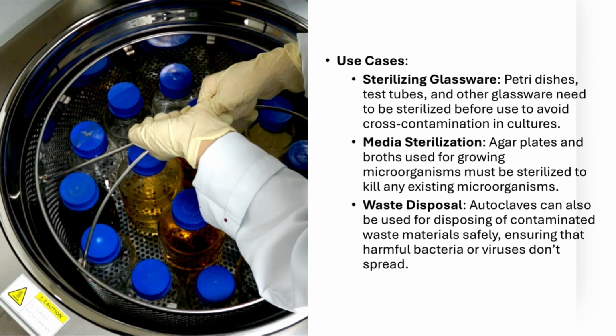Waste disposal. Autoclaves also play an important role in disposing of contaminated materials safely. After an experiment, items like used Petri dishes, swabs, and gloves can carry harmful bacteria or viruses. The autoclave sterilizes these materials before they are safely disposed of, preventing the spread of infections. Autoclaves are indispensable in microbiology labs for ensuring sterilization and preventing contamination. Whether it's sterilizing tools, media, or disposing of waste, autoclaves play a critical role in keeping labs safe and experiments accurate.